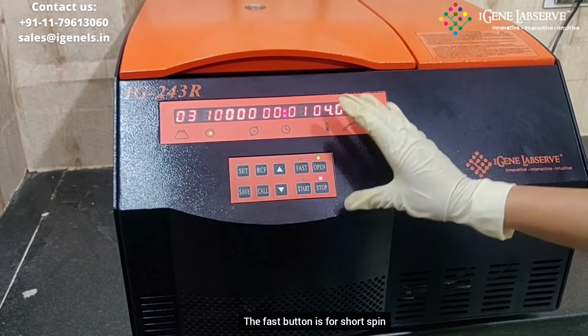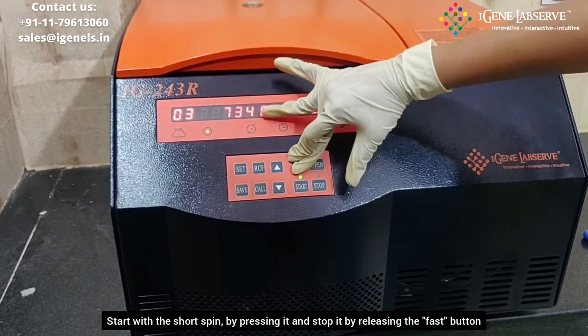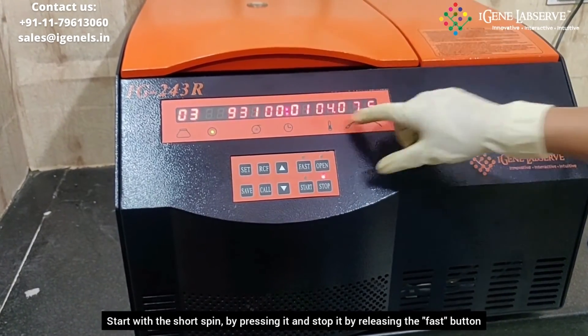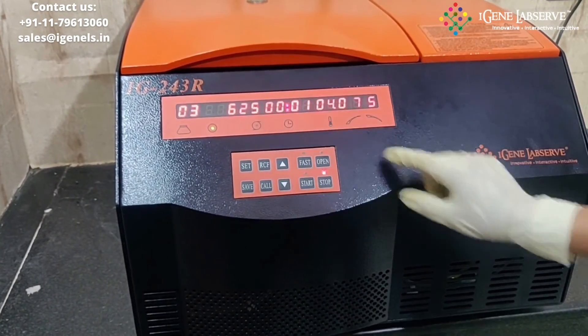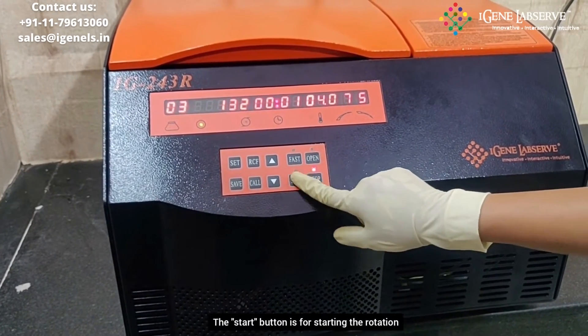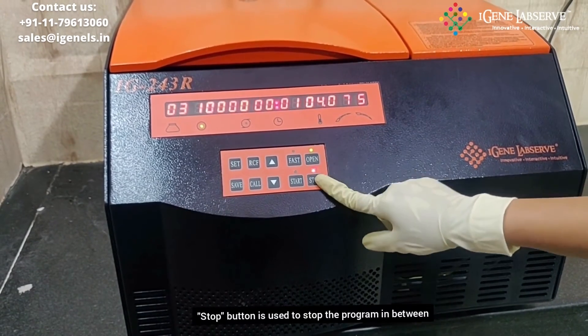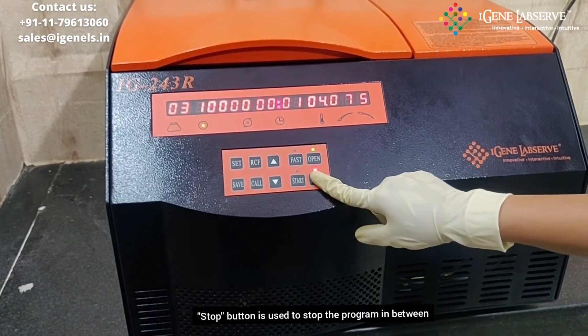This fast button is used for short spin. When you press it, the RPM increases; when you release the button, it stops again. This particular button is for starting the rotation. This particular button is used for stopping the centrifugation in between.